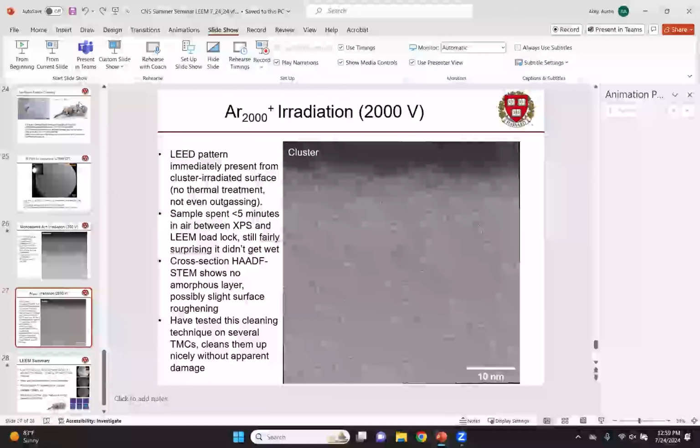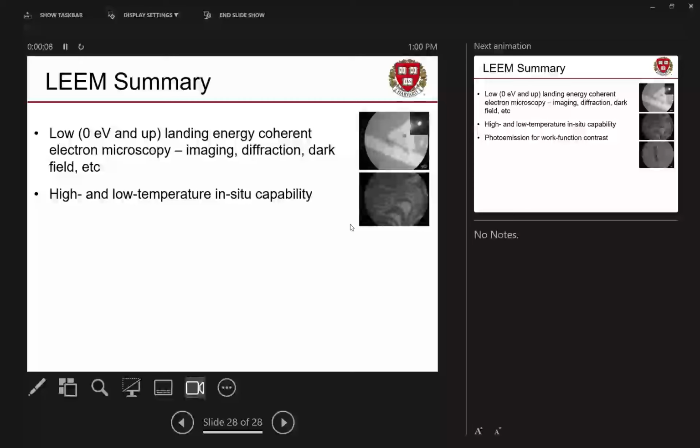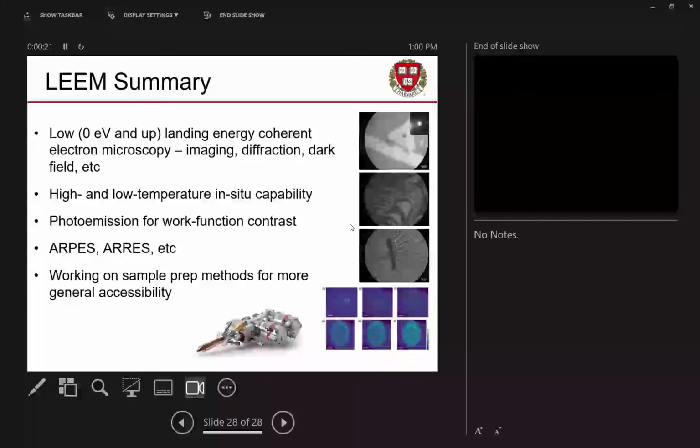All right. You guys have been really, really patient, and we are right on the end of our time, so we'll do the summary. LEEM is low energy electron microscopy. We can do all these crazy different tricks with it. We can learn all sorts of stuff about the top surface of our sample. We can do it while it's hot. We can do it while it's cold. We can do work function contrast stuff. We can do all sorts of crazy spectroscopies if we're that kind of physicist. And we're trying to get it so that you can put more and more materials in it rather than just silicon carbide graphene. And that's the end.